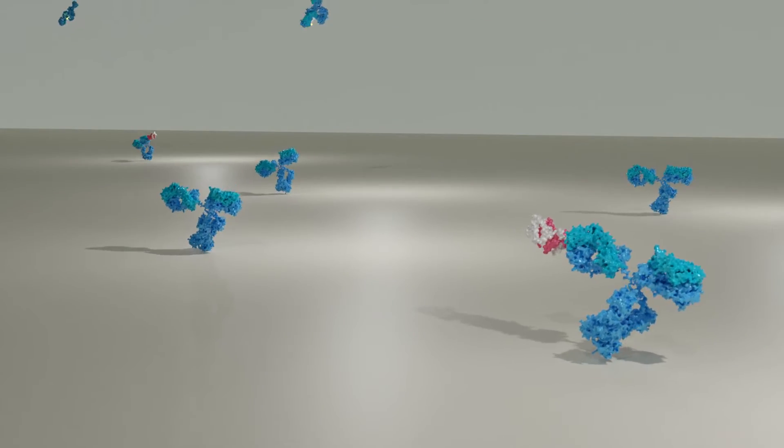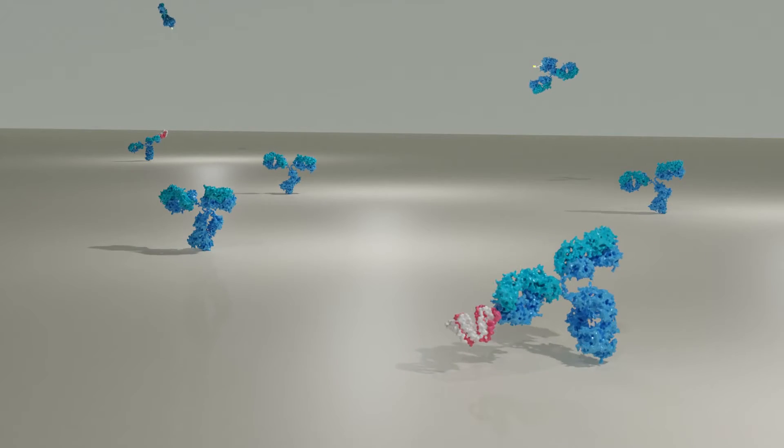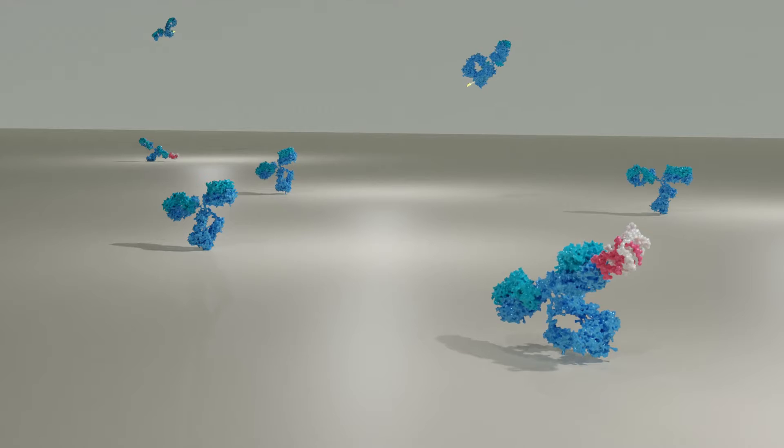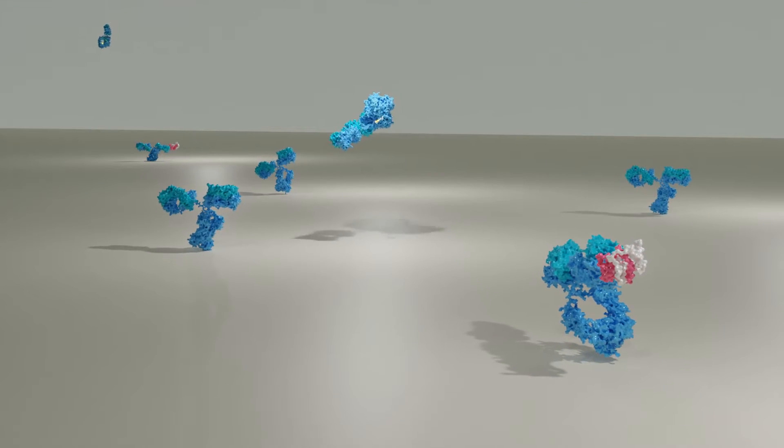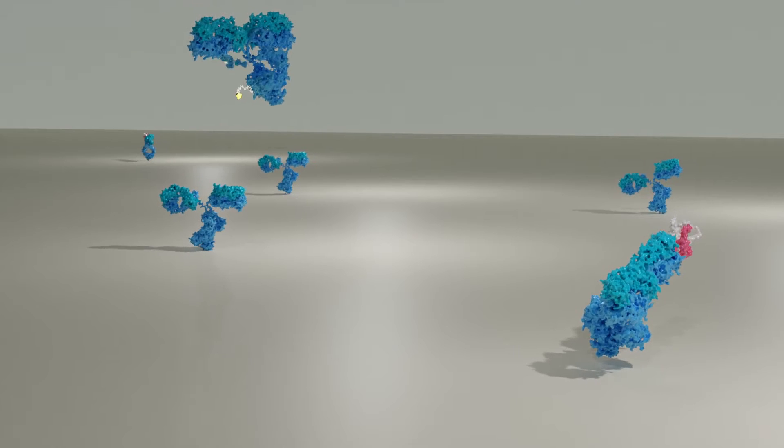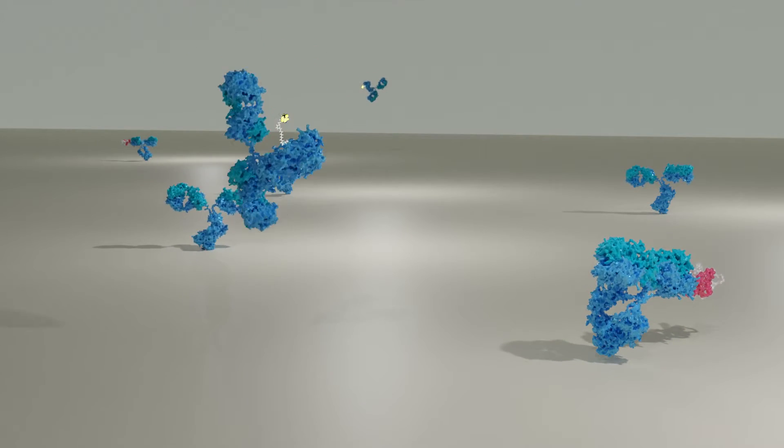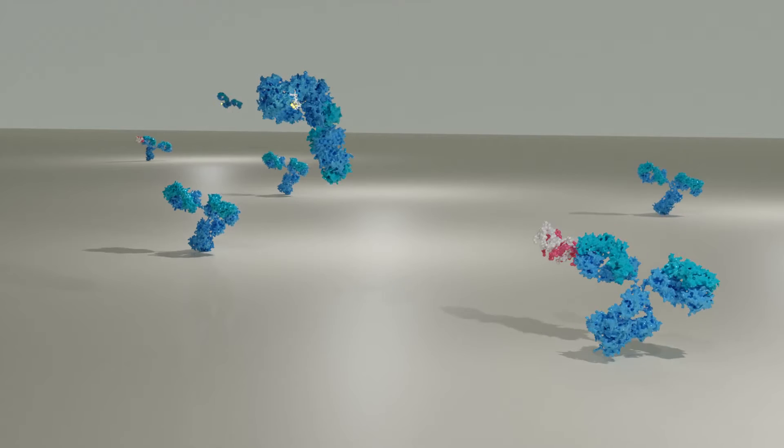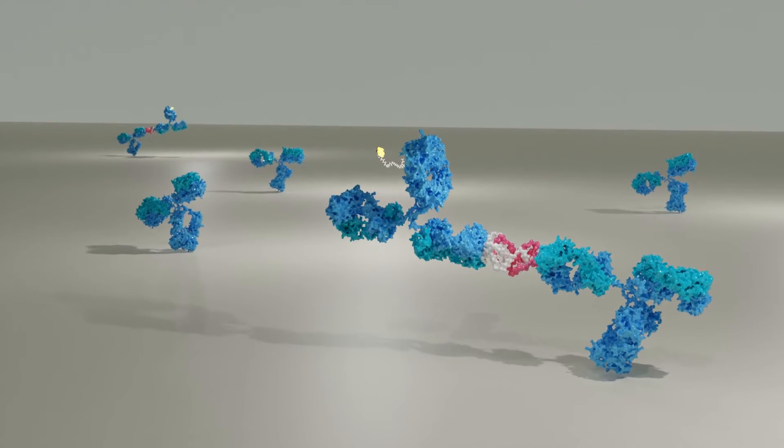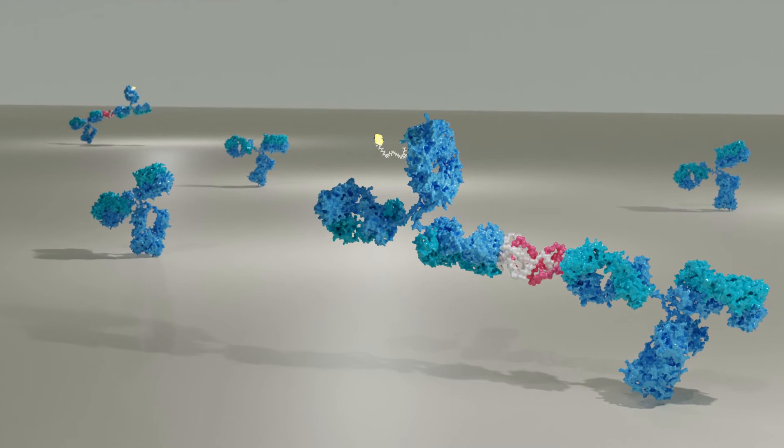A second antibody specific for gamma interferon is added. This antibody is bound to biotin. It is important to be sure that this antibody is able to bind gamma interferon bound to the first antibody. The sandwich ELISA has a high specificity since the target is bound two times by two different specific antibodies.